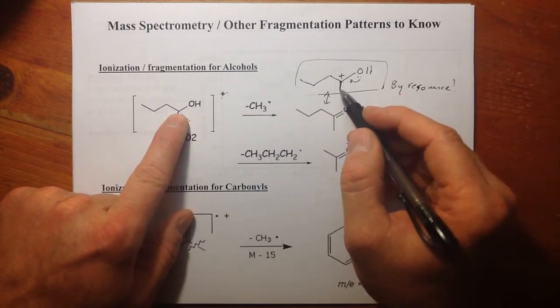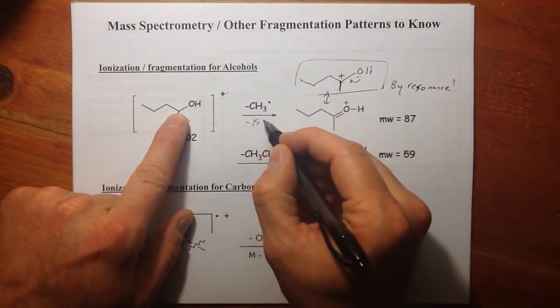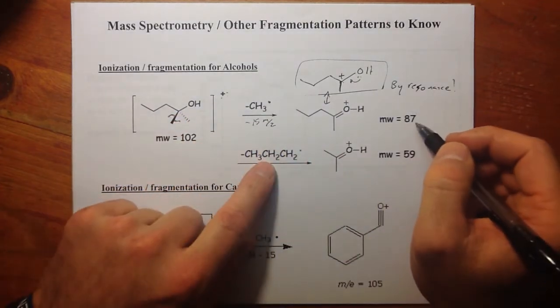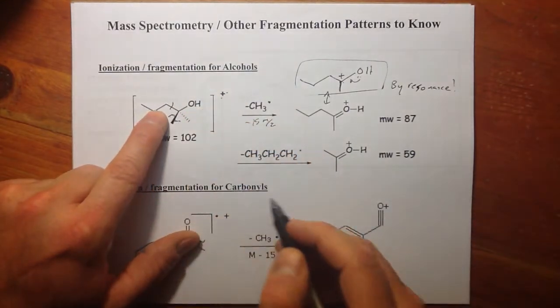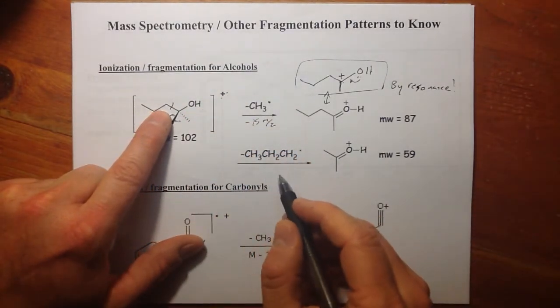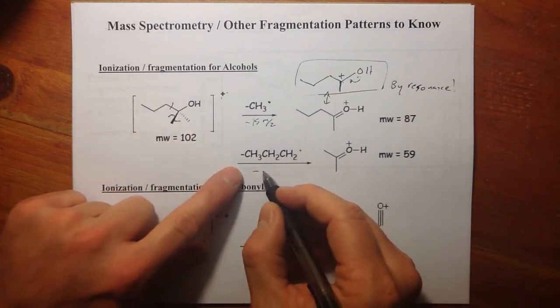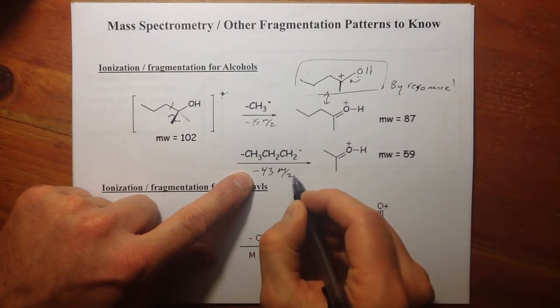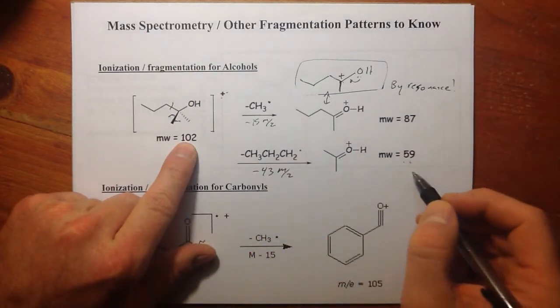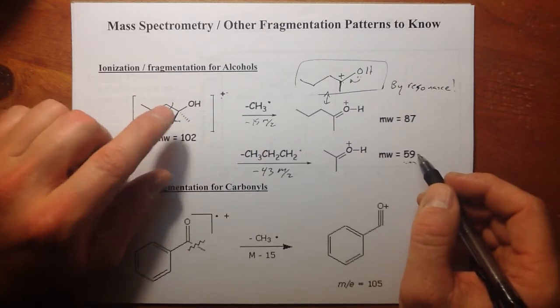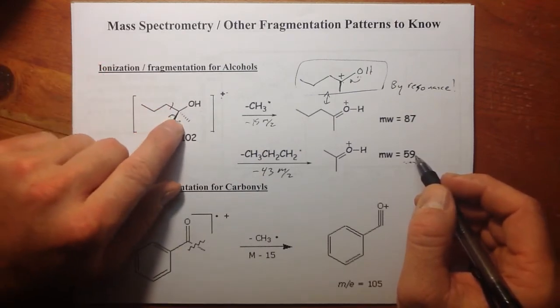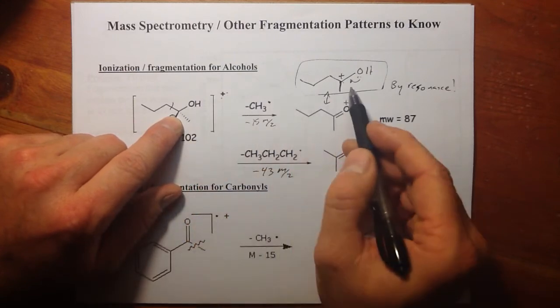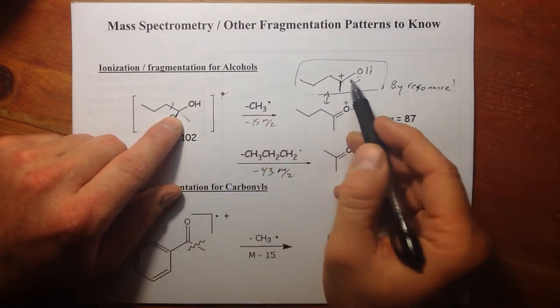So this tends to be where we see fragmentation, either of minus 15 M/z's down from the parent peak for this, so 102 minus 15 equals 87. Or we could actually kick off the propyl group as a radical and have minus 43 M/z's down from 102 to 59. So with alcohols, just think I'm always going to be considering as fragmentations loss of a carbon off of the carbon that that OH group is connected to. That's going to give me this cation that has resonance to delocalization.